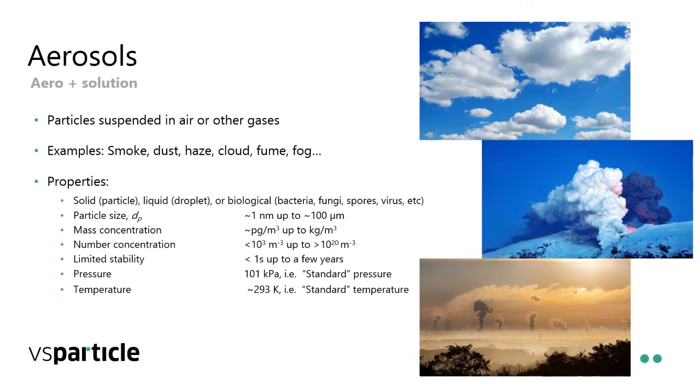and it's a ridiculously broad topic to deal with because the particles could be solid, they could be liquid, they could be biological. Perhaps the most important aerosol that we're thinking about now are virus particles that can be transported along. They're the same as a cloud, just slightly different. The particle size changes over many orders of magnitude. As long as it's below about 100 micrometers, these particles can stay afloat for a pretty long time. The mass concentration, because you get the cube of the particle size in there, rapidly crosses even more orders of magnitude.